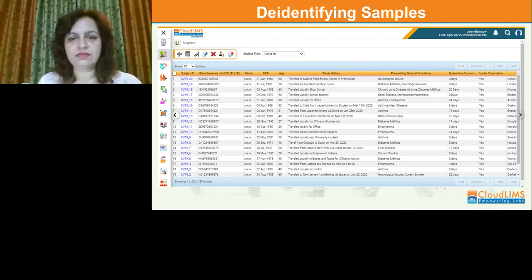And with the stigma surrounding COVID, this could prove to be a useful tool in the current scenario. So in short, all personally identifiable information is blanked out, as you see from the process in the third column, which means the PHI can be made accessible only to personnel that have the rights to access it. A digital signature is required before unmasking of the data in line with the 21 CFR Part 11.